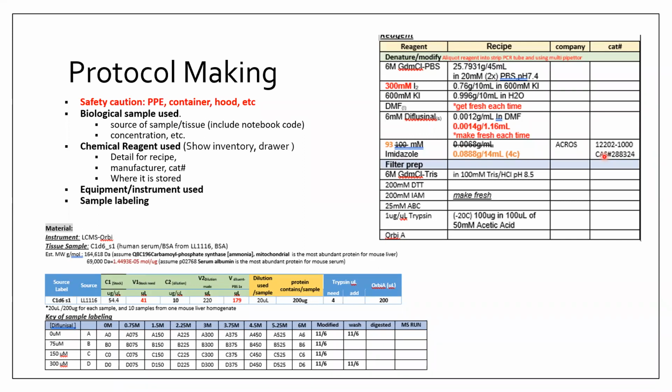Apparently some minerals or the soil provide different nutrition. That was the variable. So when you want to troubleshoot your reagents and materials, it's important that you have noted what manufacturer and what catalog number you were using.